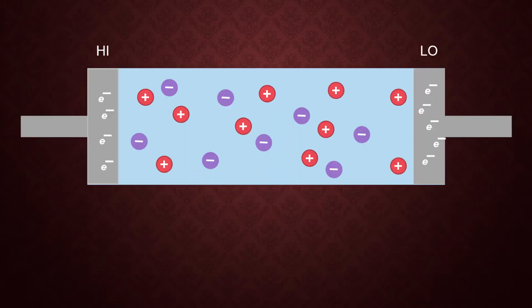So I'm using a diagram that's familiar from the previous part, namely a pair of electrodes, an electrolyte solution between the electrodes containing electroactive ions, namely ones that can undergo oxidation reduction. They're going to be represented here by the cations.